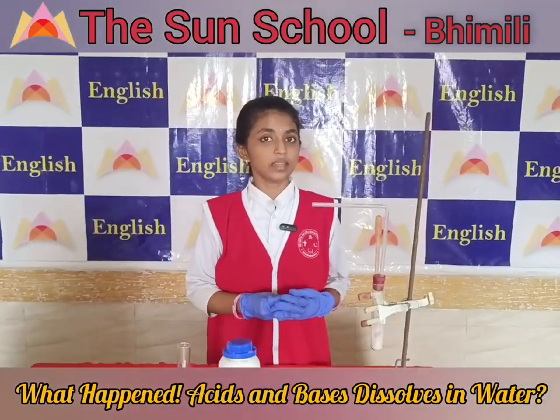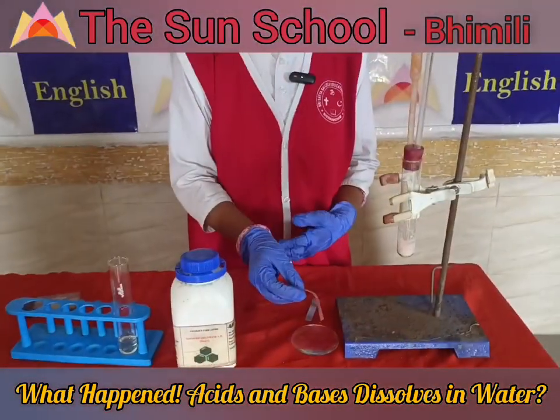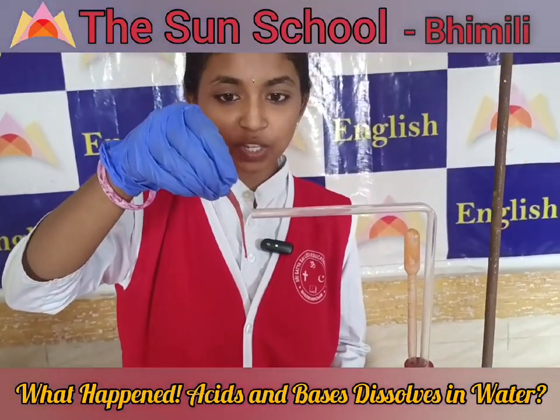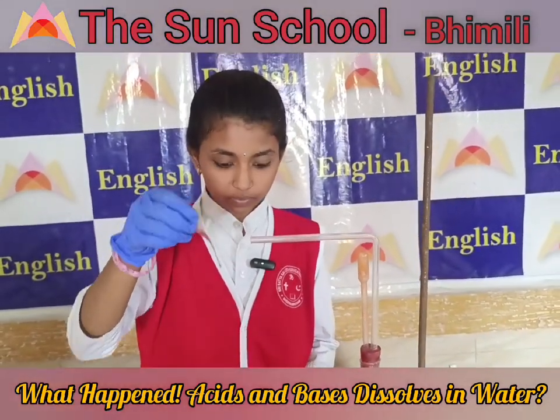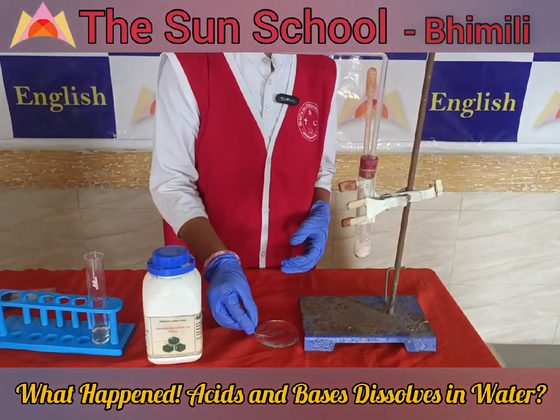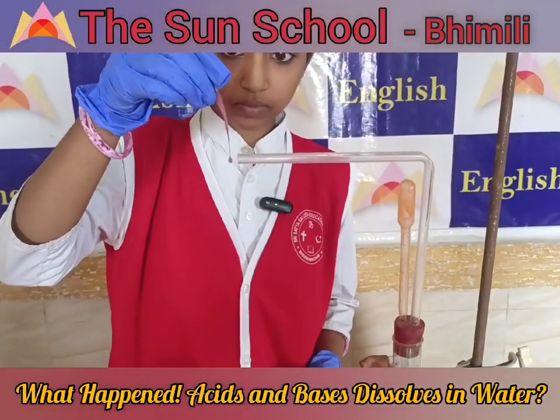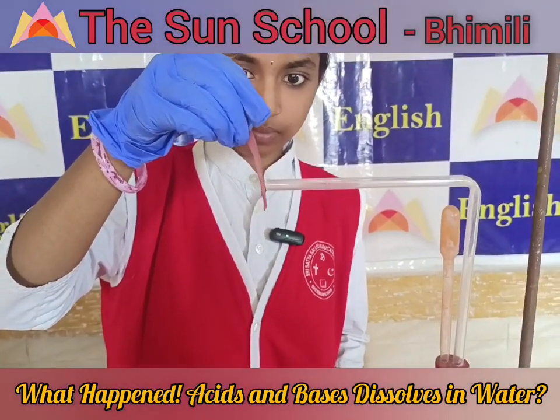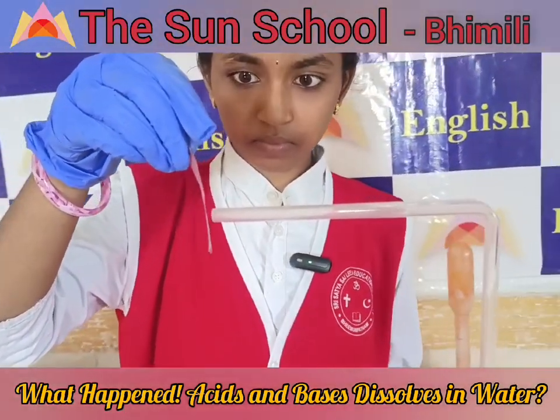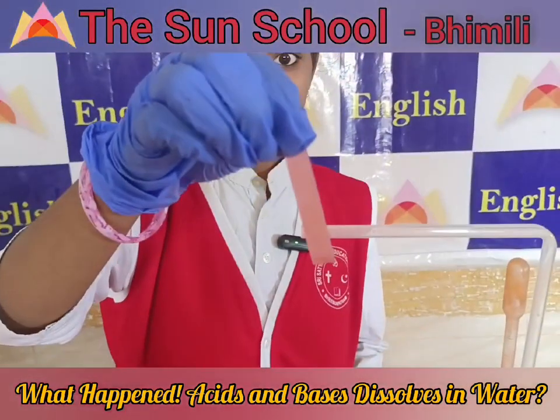Now let us test the nature of the gas with wet litmus papers. Take wet red litmus paper near the mouth of the delivery tube. There is no change in the red litmus paper. Now take wet blue litmus paper. The blue litmus paper turns red.